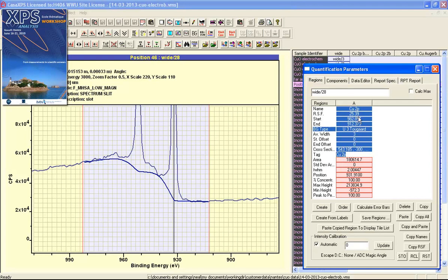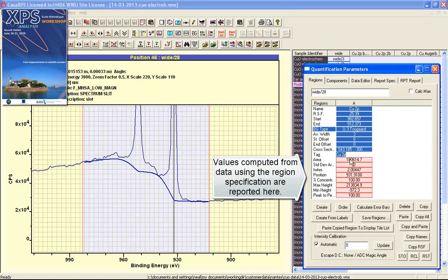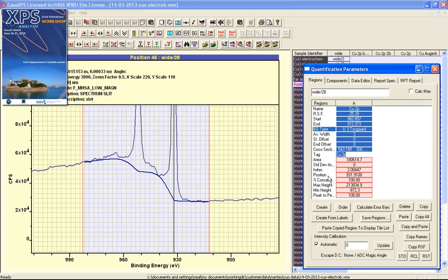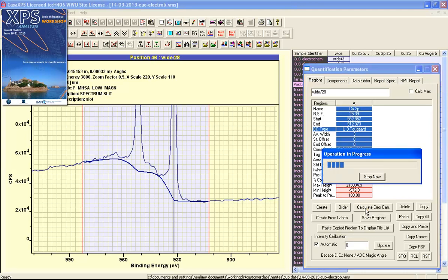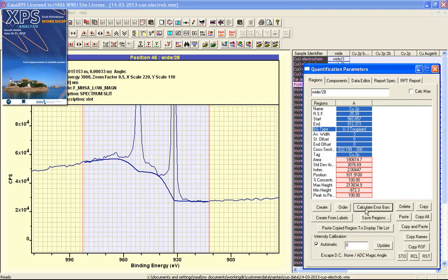Following these parameters, the outputs are displayed here. They represent the area that's calculated for the peak above background. There's a standard deviation, and if we press calculate error bars, then the uncertainty in the peak area is calculated using a Monte Carlo simulation.